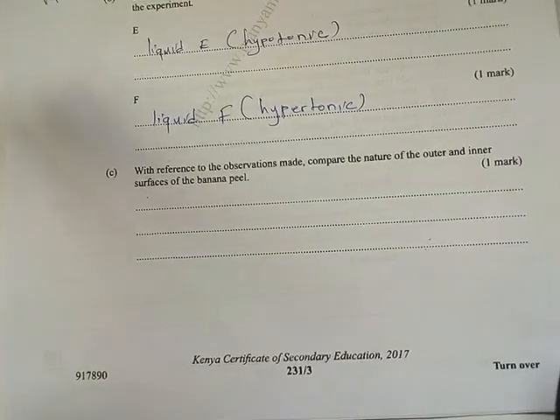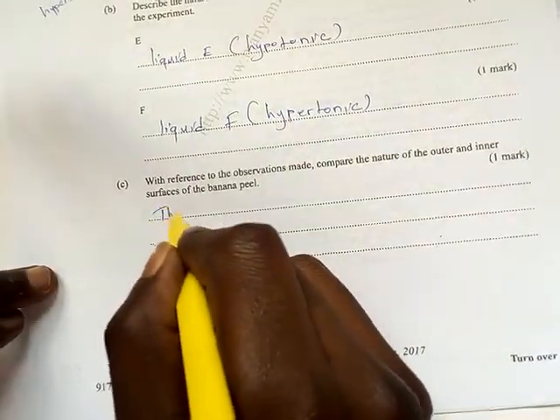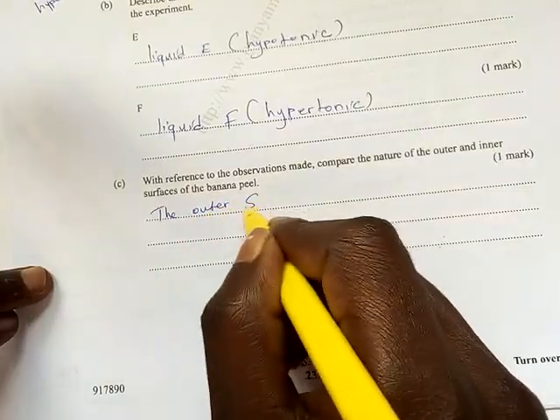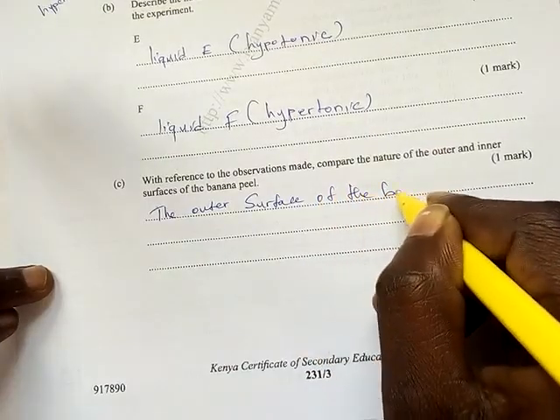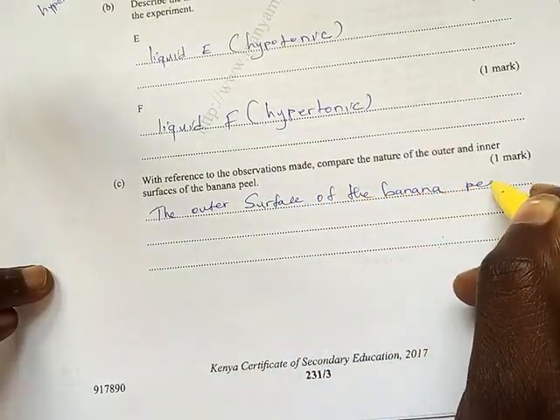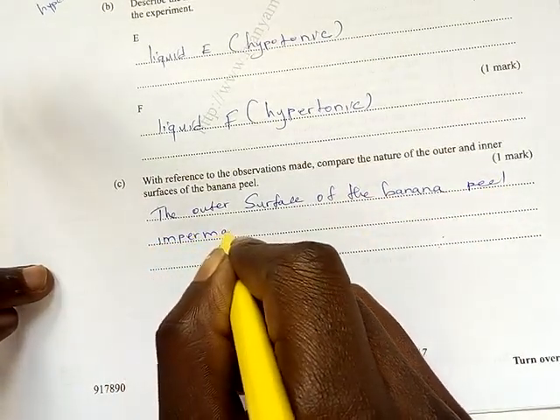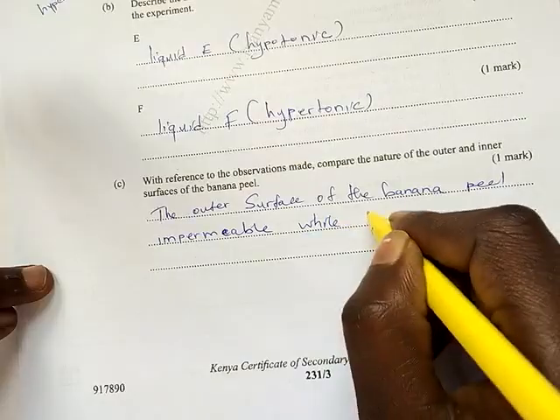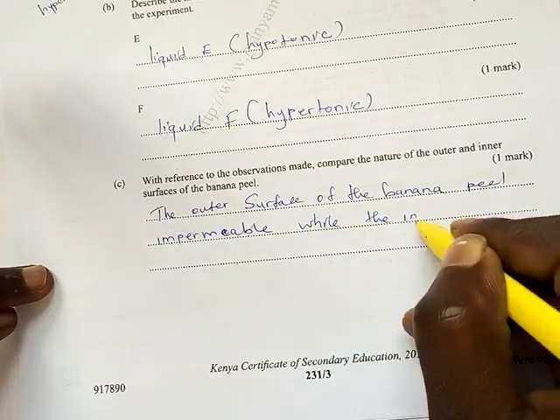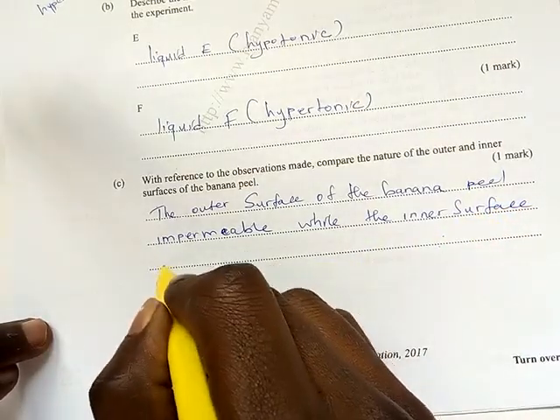With reference to the observation made, compare the nature of the outer and the inner surface of the banana peel. Now the outer surface of the banana peel is impermeable, while the inner surface is permeable.